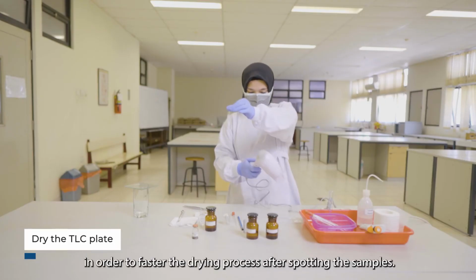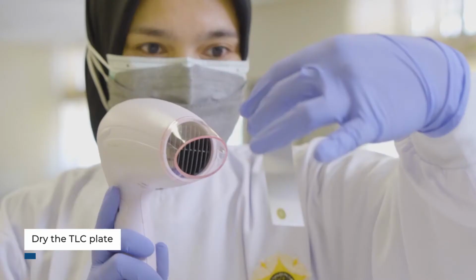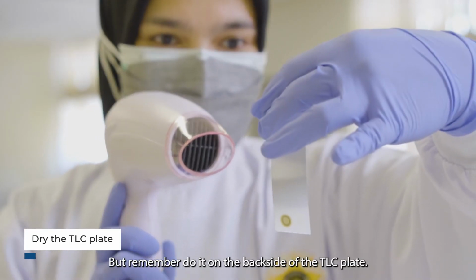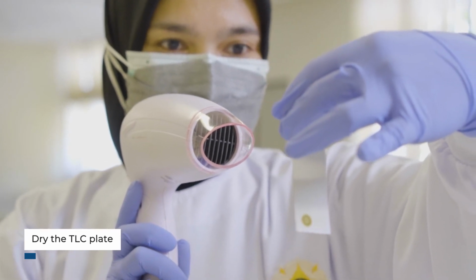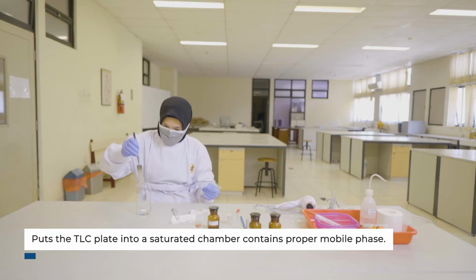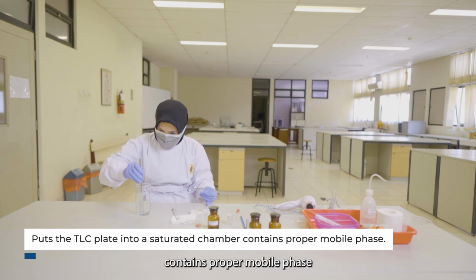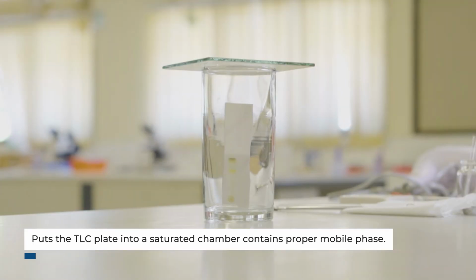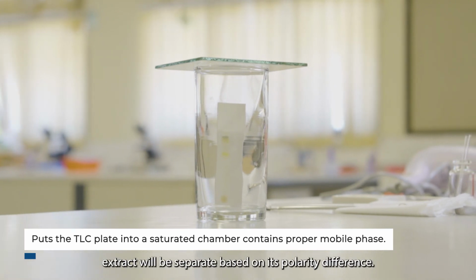Use a hairdryer in order to foster the drying process of the spotted samples. But remember, do it on the back side of the TLC plate. Put the TLC plate into a saturated chamber containing the proper mobile phase. In this step, many compounds within the sample extract will be separated based on their polarity difference.